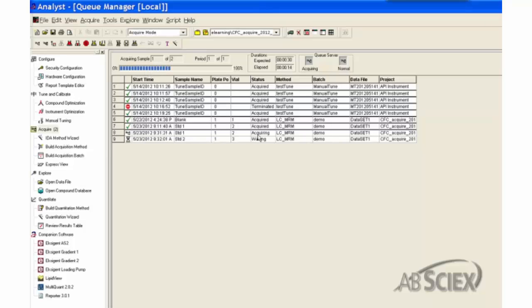After the sample is finished, the system will automatically start the sample analysis of the next sample in the queue.